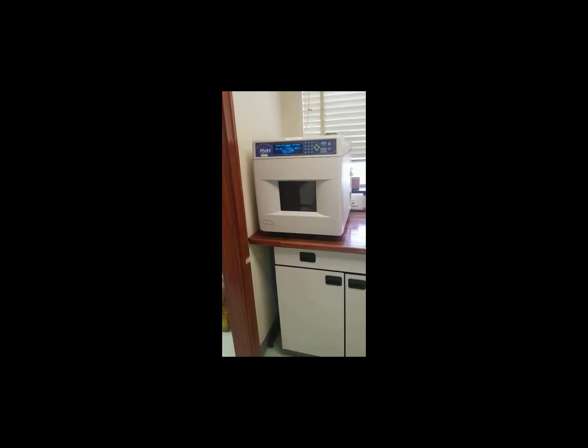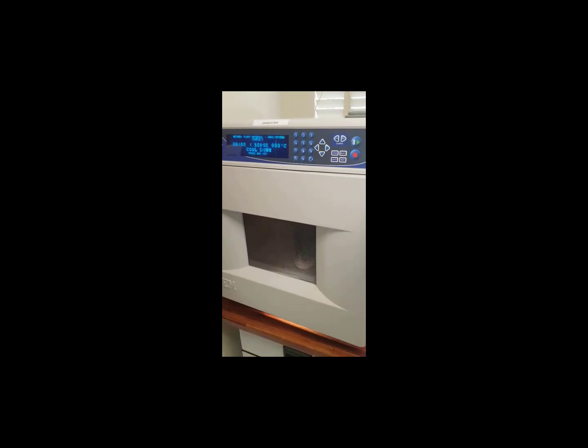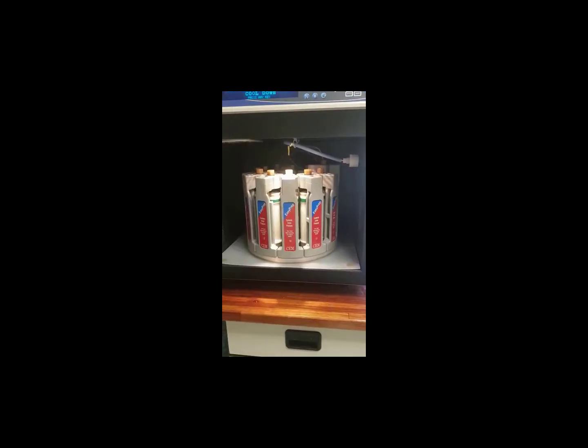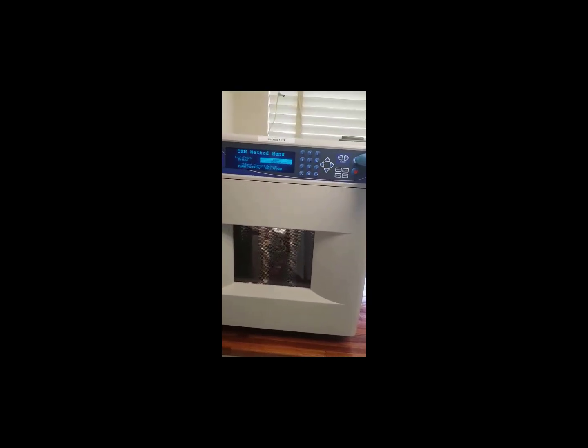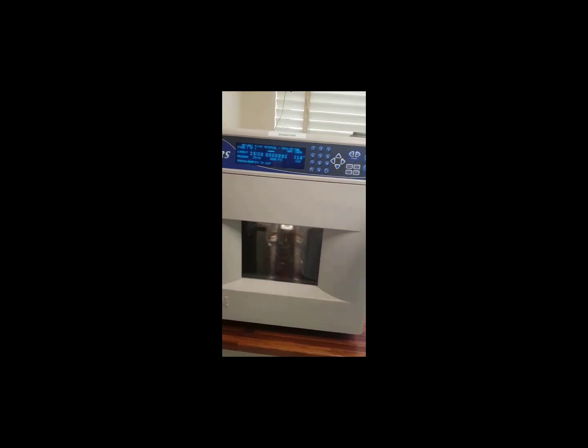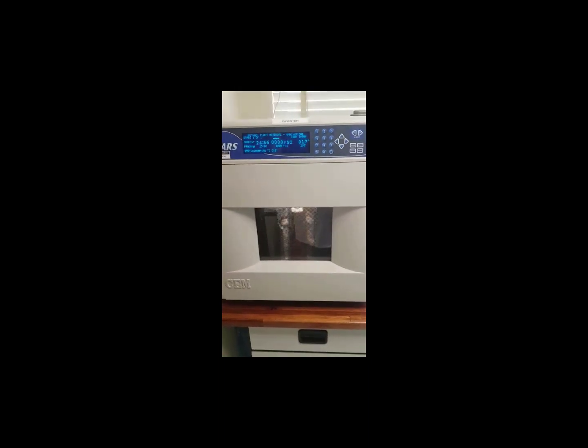The carousel is inserted into the Mars microwave digester with the sensors to measure the temperature and pressure inside the cavity. The samples are digested according to preset EPA digestion methods. Once the program for the digestion is completed, the carousel is left to cool before removing the vessels from the carousel. This is to ensure that volatile elements like mercury are not lost during this process.